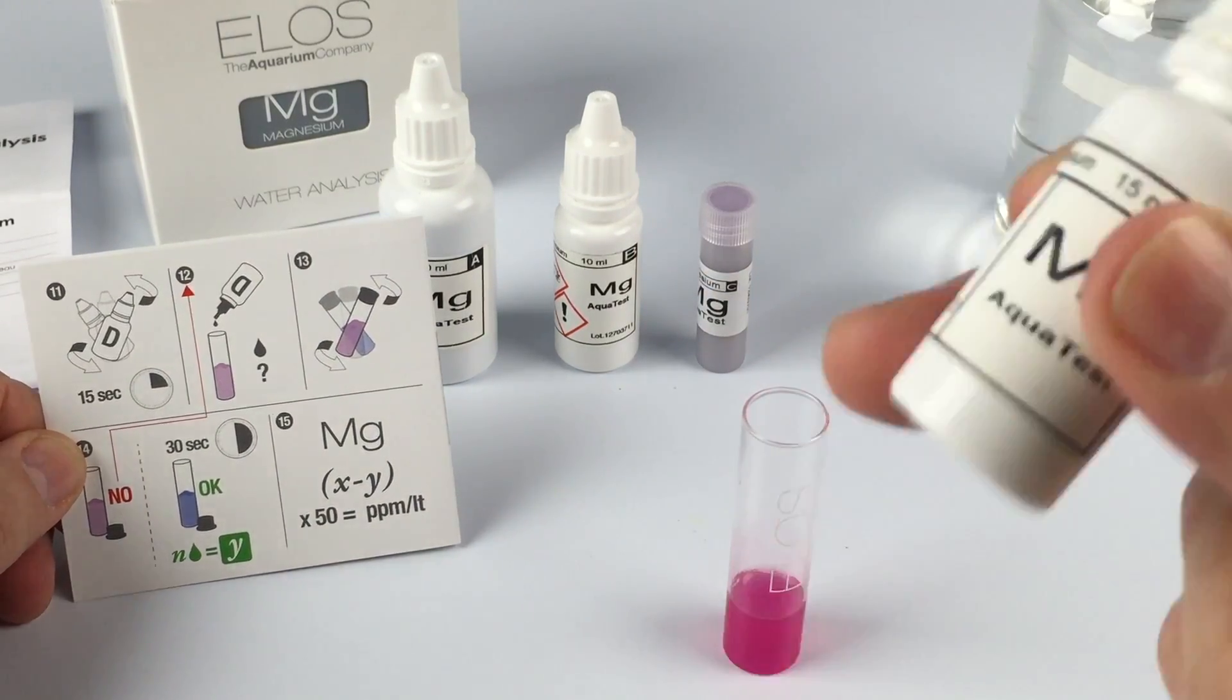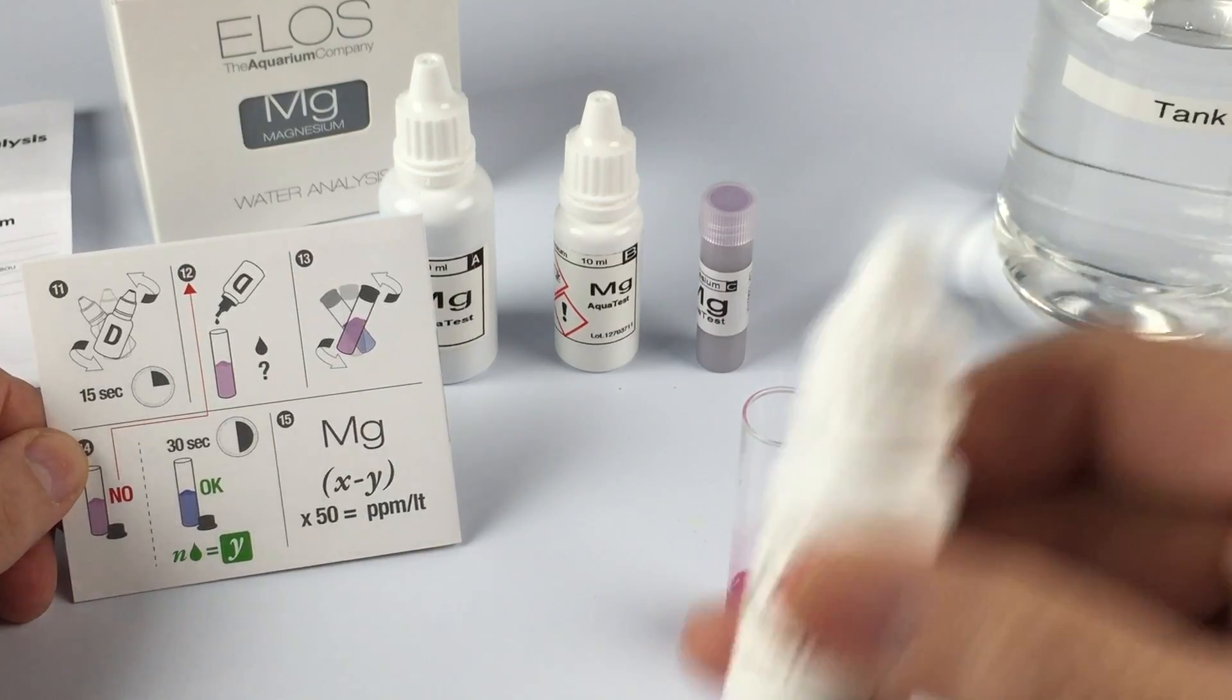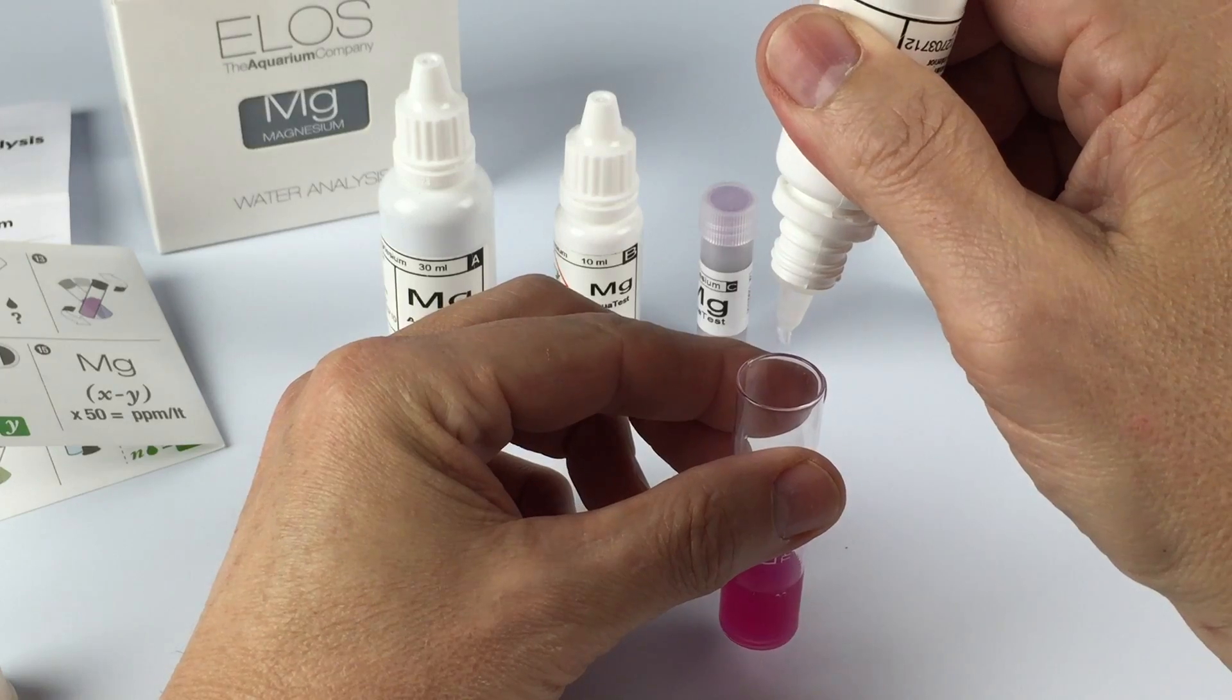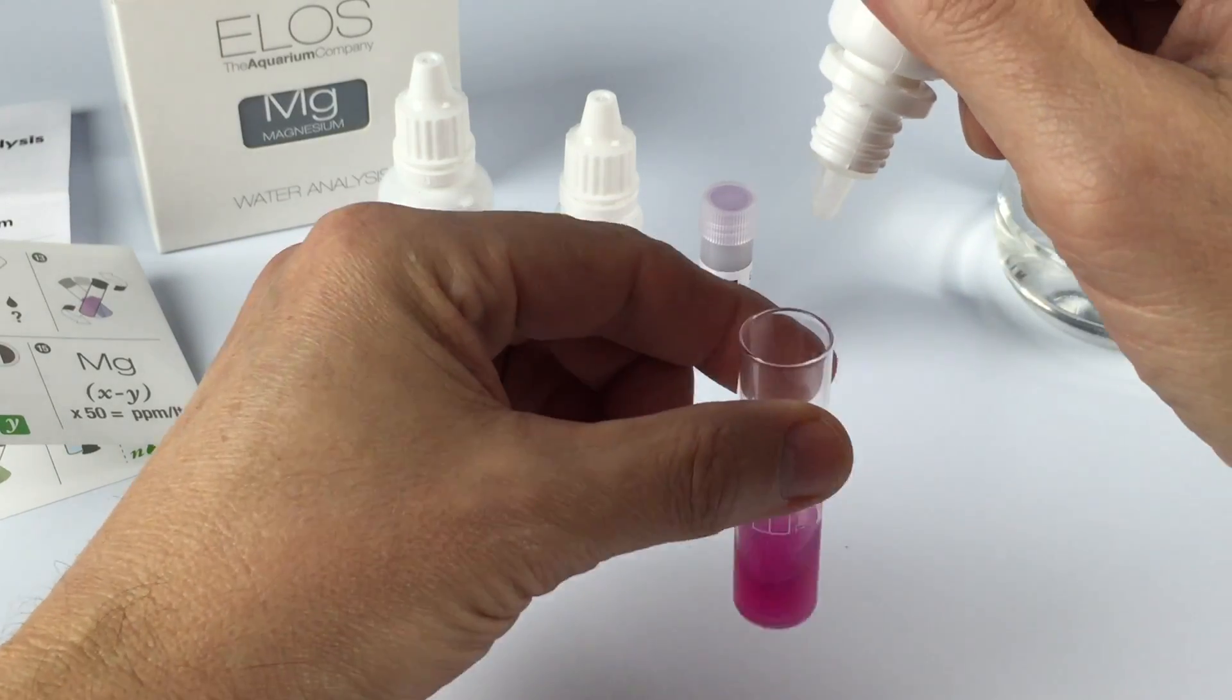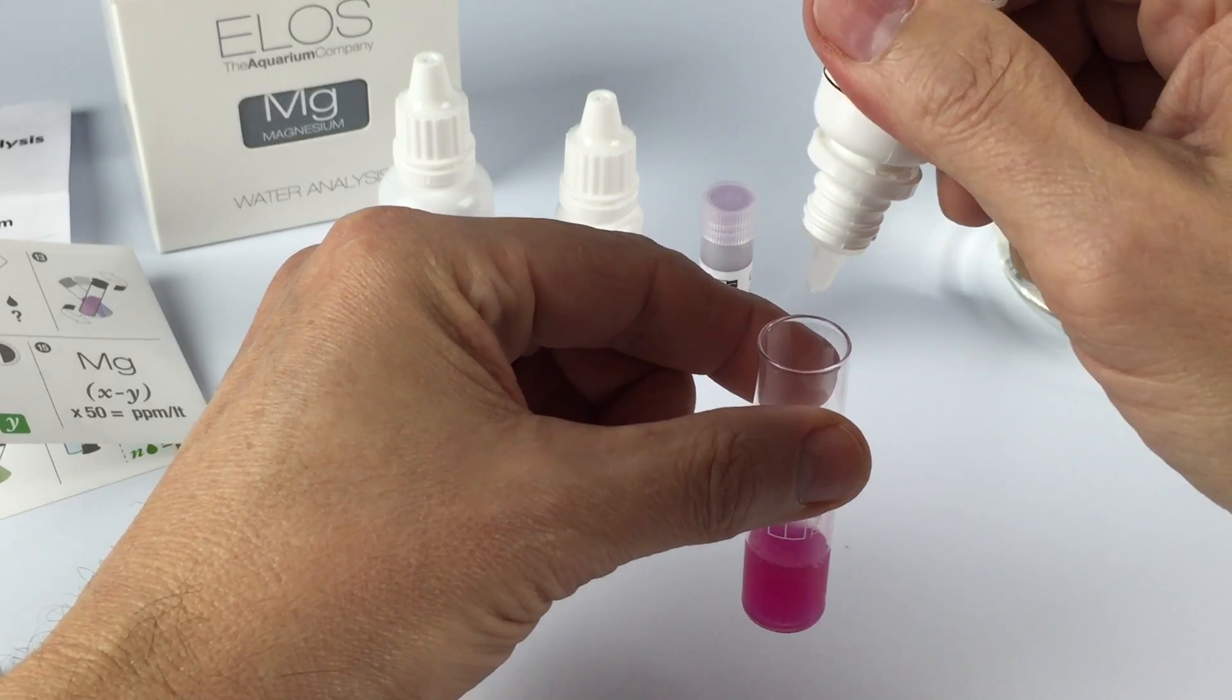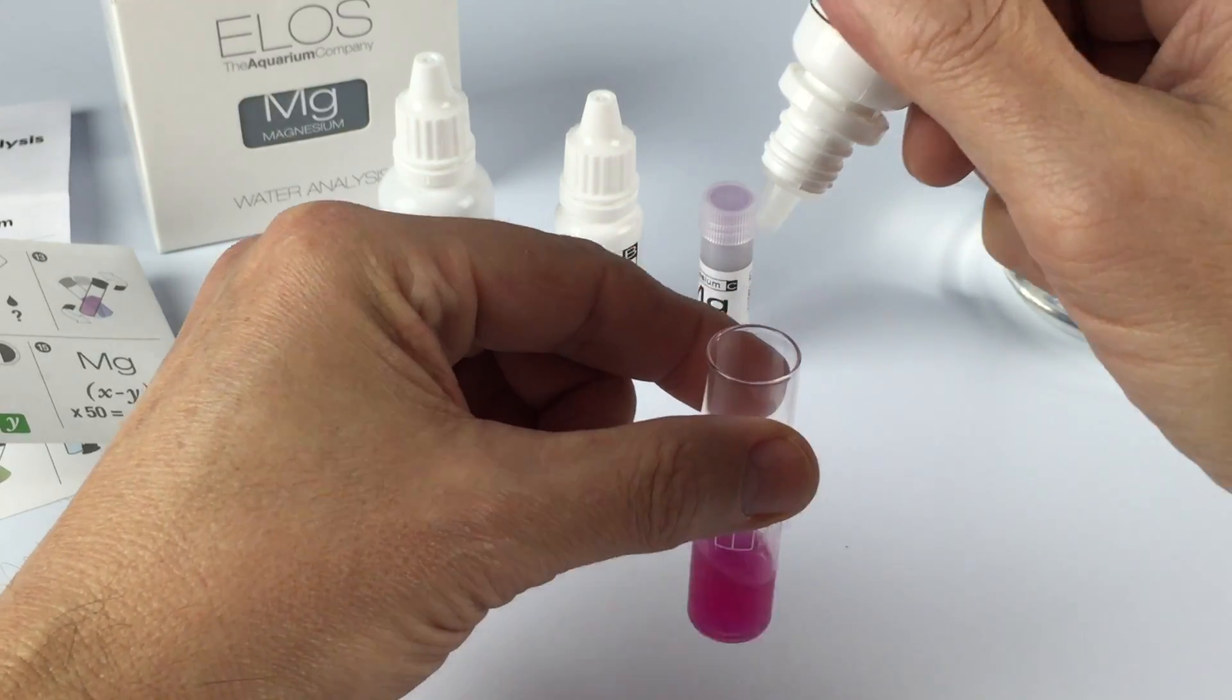Shake Part D for 15 seconds. Lastly, we're going to add one drop at a time, shaking the vial and keeping track of how many drops we use. In this case, it took me five drops to turn the solution from pink to blue.